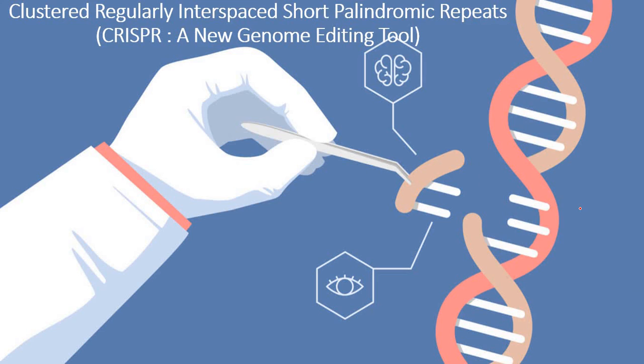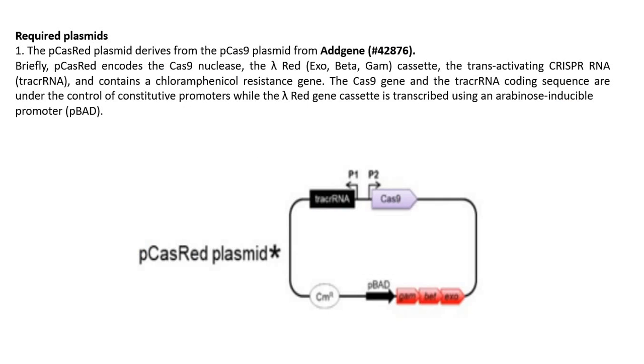So in the previous lecture, we learned about the basics of CRISPR, and in this lecture, we are going to learn about the practical aspects of CRISPR, how you can perform the experiments while you are in the laboratory. As you know, for doing gene editing we are using CRISPR, either doing the knock-in or the knockout. We can use CRISPR along with other techniques.